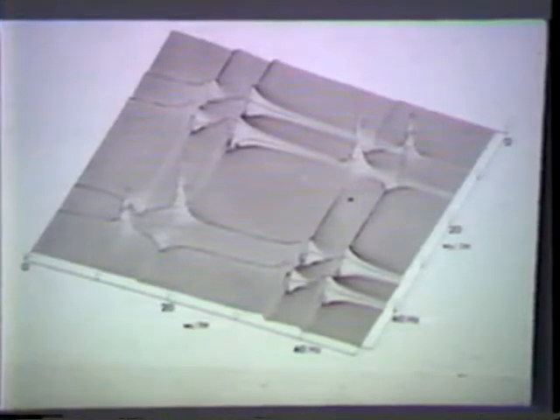If one had only pure absorptive line shapes and converted some of these cross peak line shapes from, for example, a Lorentzian to a Gaussian, you'd have very, very little ridge. But it's not noise, it's real. It's just that's the shape of the dispersive. It's in the calculated spectrum also. These ridges were the ones which created a lot of difficulty in the beginning, particularly in applications to biological systems where signal to noise was a problem.